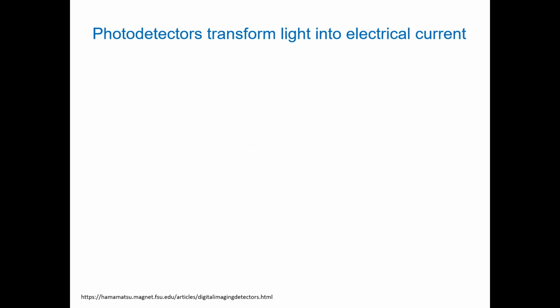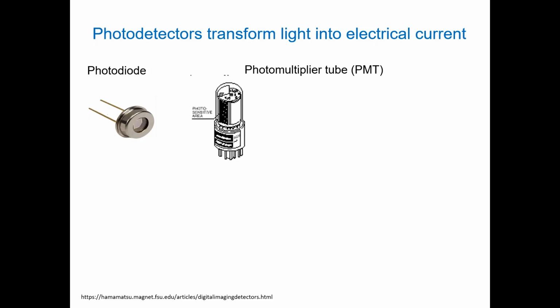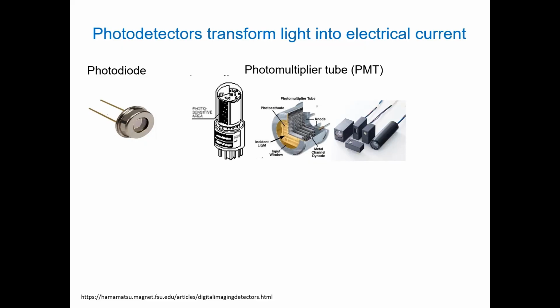Now we'll look at these light detectors. There are several different kinds of light detectors. Simple photodiodes, which are relatively insensitive detectors, are used for strong light signals like forward scatter. Photomultiplier tubes, or PMTs, are highly light sensitive and used for side scatter and fluorescence. On the left is the classic older large PMT that we find on the Caliber and the LSR2 and the older sorters. The newer smaller versions are currently used on many instruments, and on the right is a PMT array consisting of 32 PMTs used in some of the new spectral instruments.